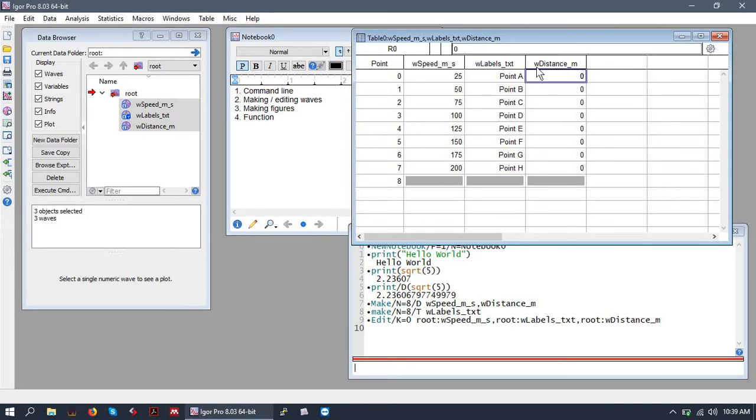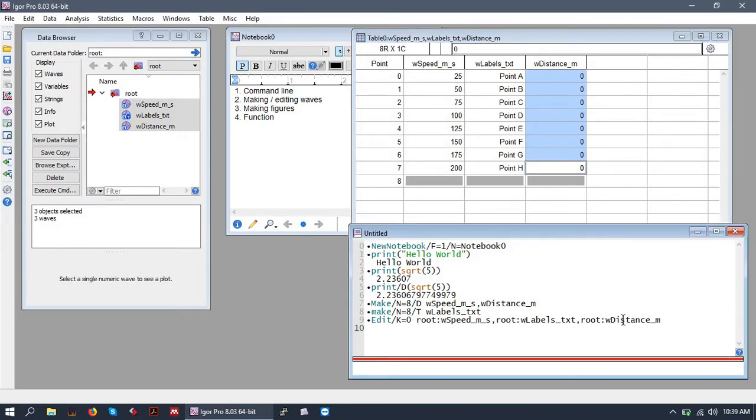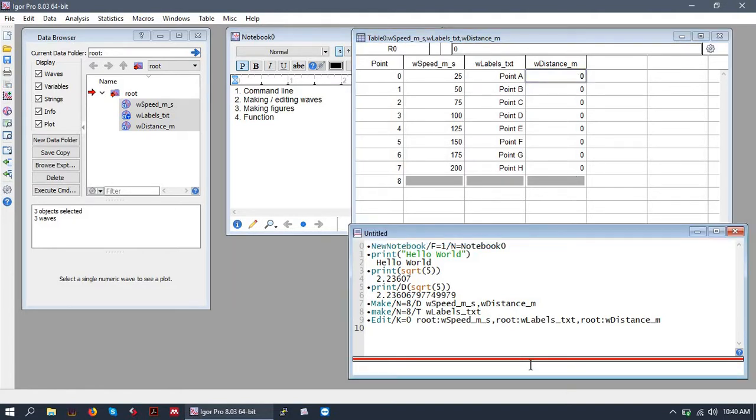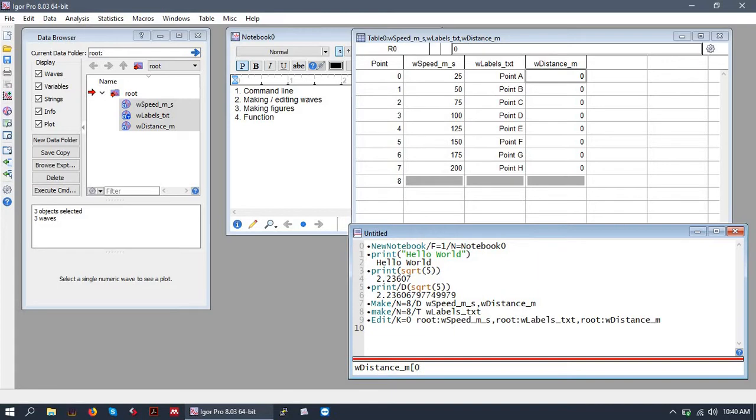And then I will put some values into the distance wave using the command prompt. So let's say we wanted to put in the index zero, the first index of the wave, a value of 100. What we would do is write the wave's name using a square bracket.